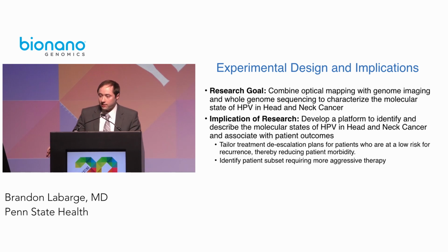Our research goal was to combine optical mapping with genome imaging from bio-nano and whole genome sequencing from Illumina to characterize the molecular state of HPV in head and neck cancer. The implication of our research is to develop a platform to identify and describe the molecular states of HPV in head and neck cancer and associate these with patient outcomes.